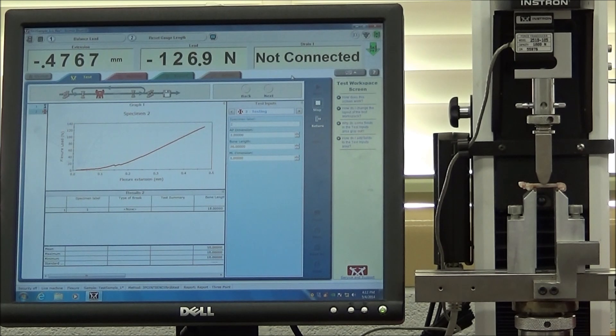And I may have misspoke earlier. It doesn't look like that earlier bump in the road was a yielding. It looks like it was more of just a settling in of the bone into the fixture here. So it looks like we might actually be yielding now. The curve is beginning to flatten out. That's usually pretty indicative of a yield point. We'll kind of float at this load for a little while. Things will settle down and then eventually the bone will fracture. And we'll call that the fracture load.